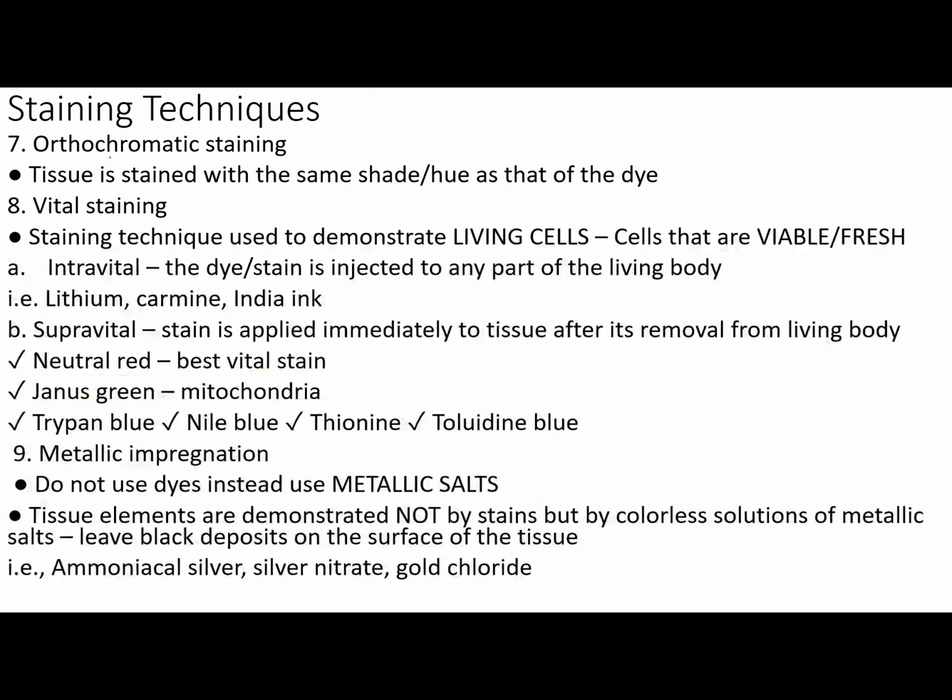Then another one is your orthochromatic staining. So tissue is stained with the same shade or hue as the dye. Another one is vital staining. So vital staining would usually involve the demonstration of living cells, cells that are basically viable or fresh.